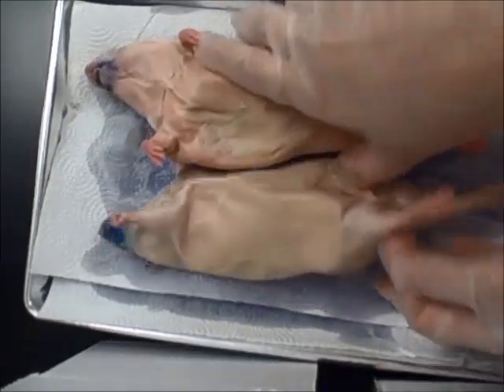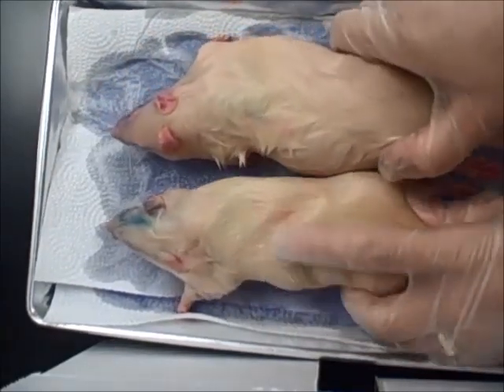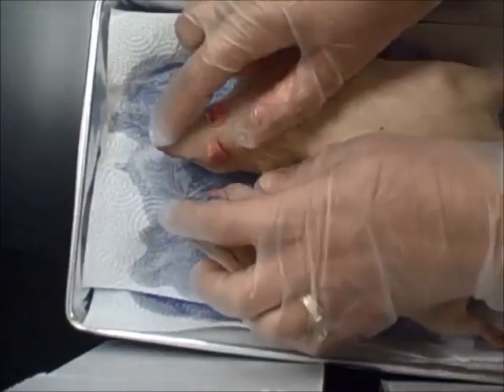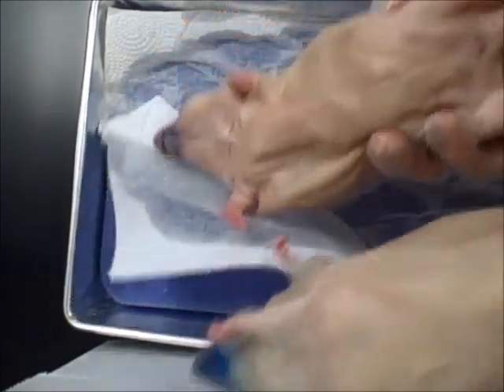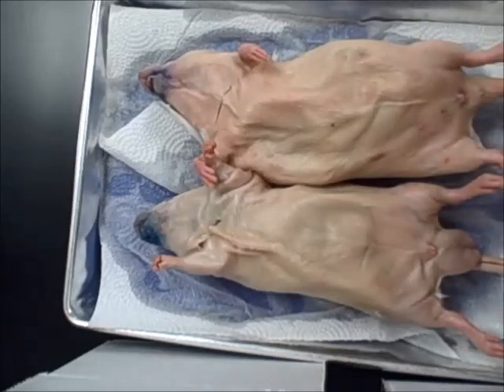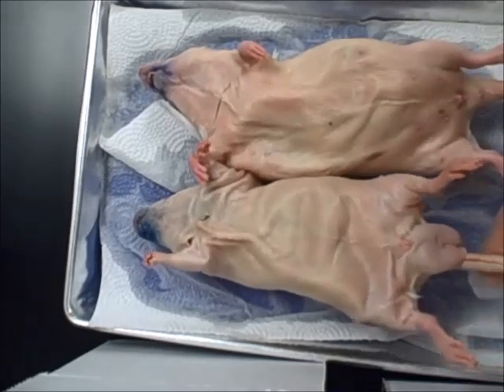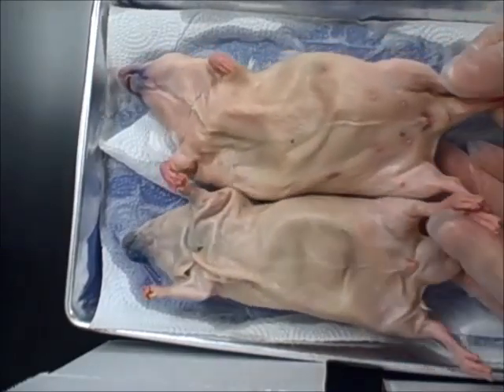Okay, for the rat dissection, first of all, we've got the dorsal side. Dorsal is toward the back, anterior toward the head end, posterior toward the tail, and ventral is the belly side up. So on the left side of the screen, we have a male rat, and the right side of the screen is the female rat.